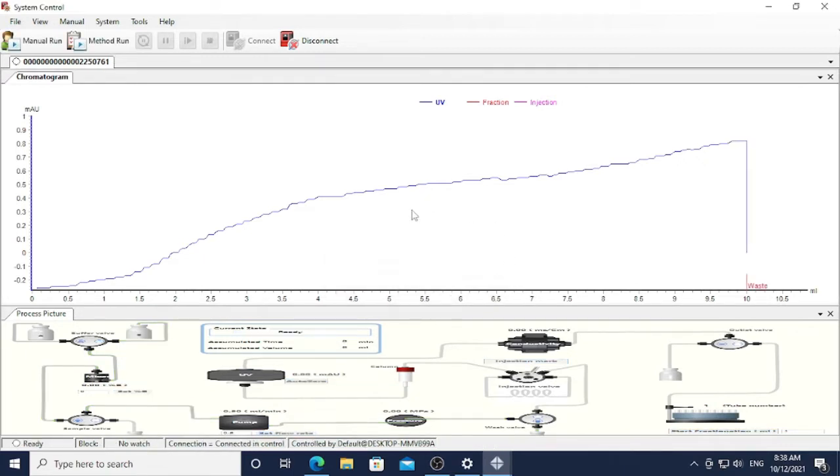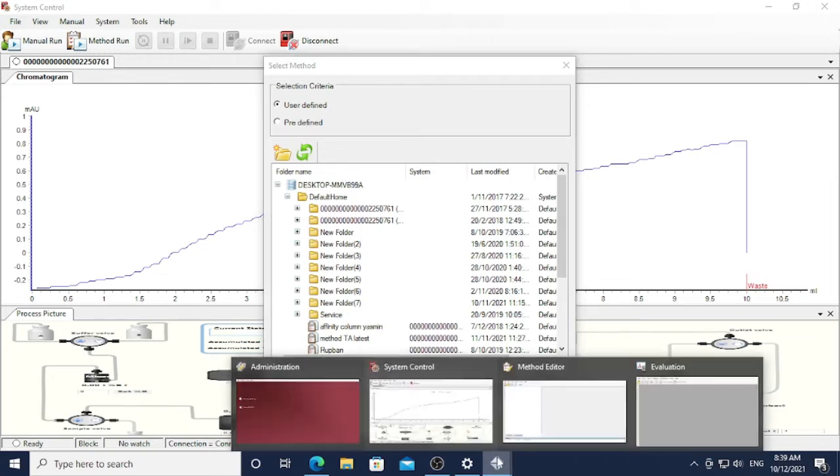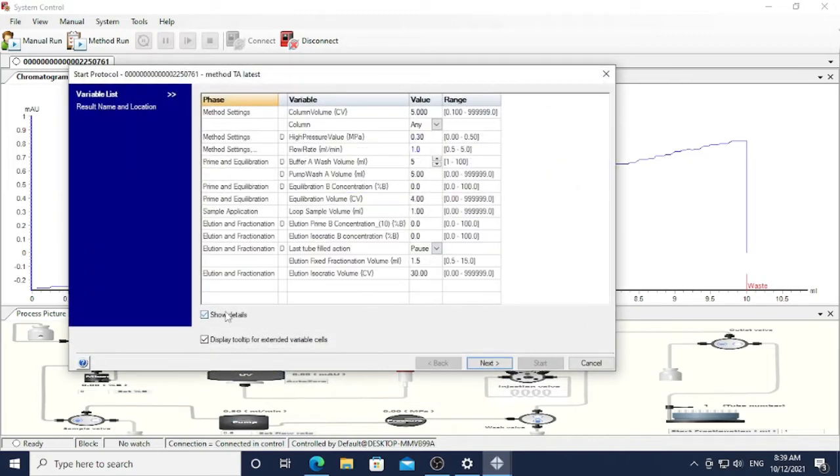The notification sound will come out again once you finish washing pump B. Now I am going to show you how to clean the column. I am using my own defined method to wash my column, which you can edit in the Method Editor. I choose the method called TA Latest because I am doing tanaka early and spread. You also need to adjust the method according to the sample you are running.